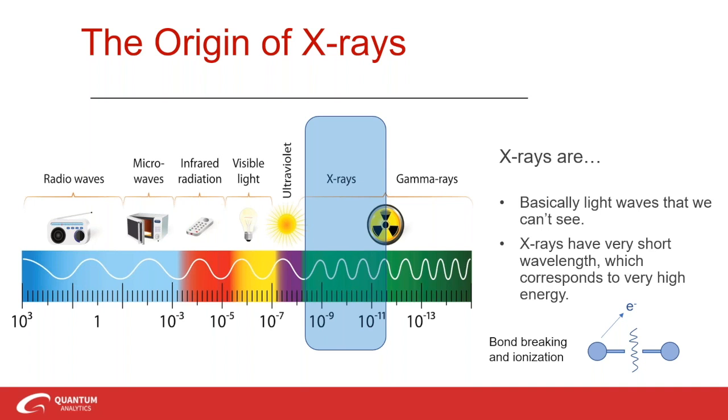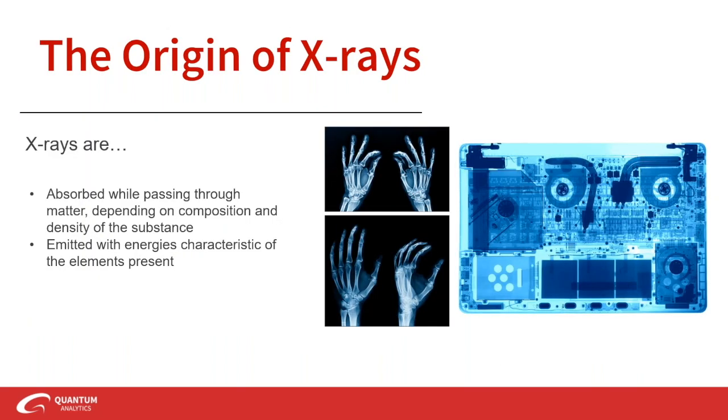So the thing to think about with this radiation is the intensity. It's the number of the photons that are emitted or measured per unit of time. We will use the number of X-ray photons measured per second. So you'll see sometimes counts per second or CPS as the unit of intensity. But don't worry about that right now. We'll come back to that in a bit.